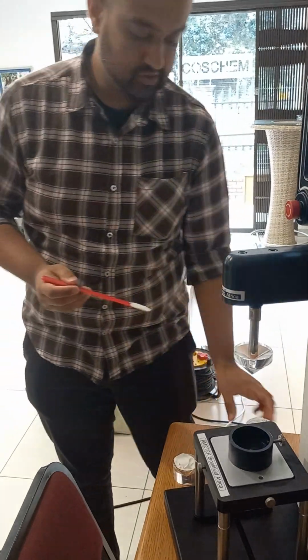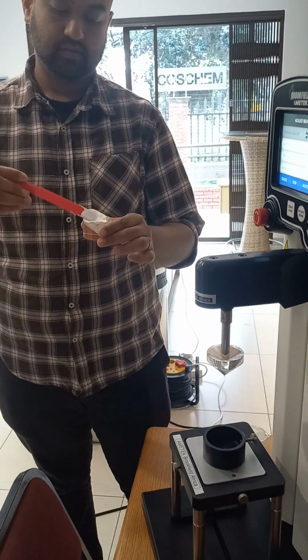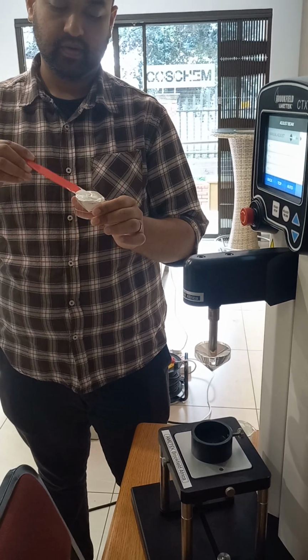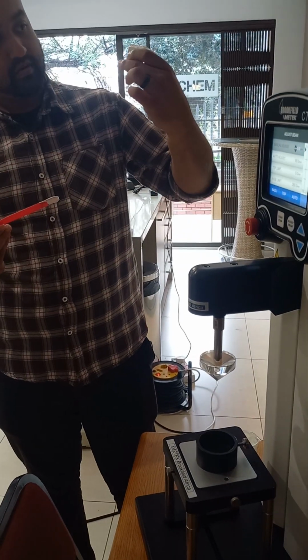Okay, we just make sure that we don't have a lot of air in the sunscreen because that will compromise the analysis. So as I'm adding it, I'm just trying to release whatever air bubbles are in there. That's all good.